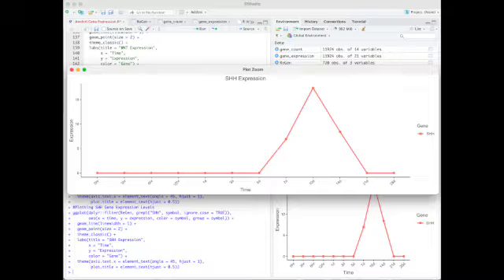While it is being expressed, it is telling the cells within the blastema where to position to form posterior structures, or fingers. It is expressed only when it is required to give this information, which we can see in this graph.